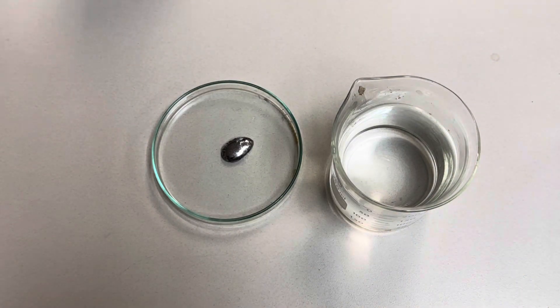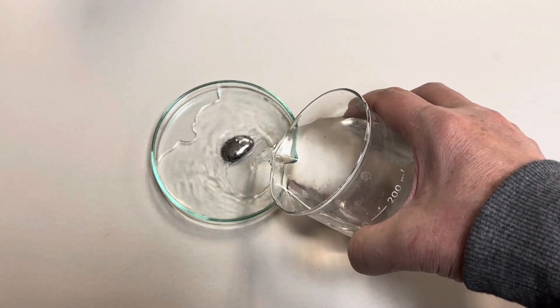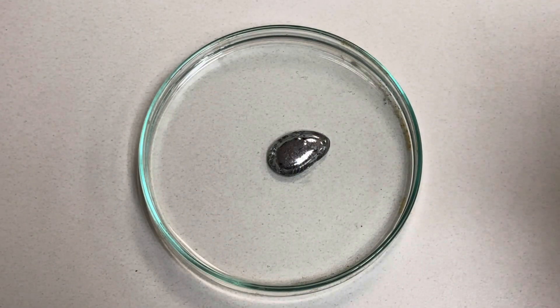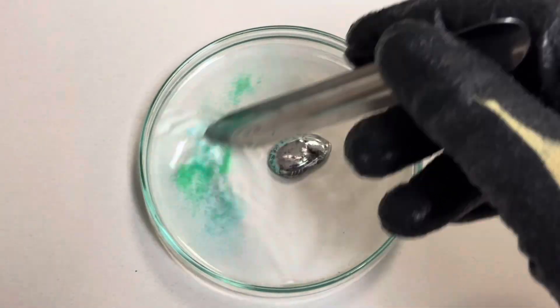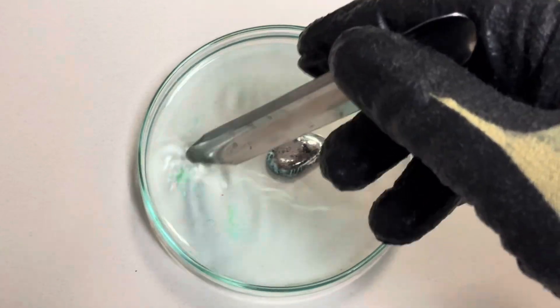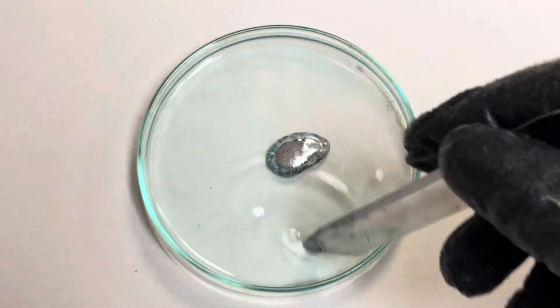The first step is to add a drop of gallium to your petri dish and then add a little bit of distilled water. Next, add half a gram of copper 2 chloride to the solution and mix it around until you have a nice even homogeneous solution. In this way you're adding copper ions to your petri dish.